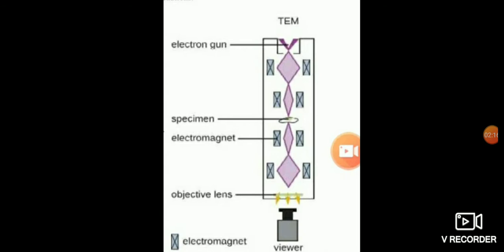However, in TEM, the transmission of the electron beam is highly dependent on the properties of the material being examined. Such properties include density, composition, etc. For example, porous materials will let more electrons pass through, while dense materials will let fewer. As a result, a specimen with non-uniform density can be examined by this technique. Whatever part is transmitted is projected onto the phosphor screen for the user to see.